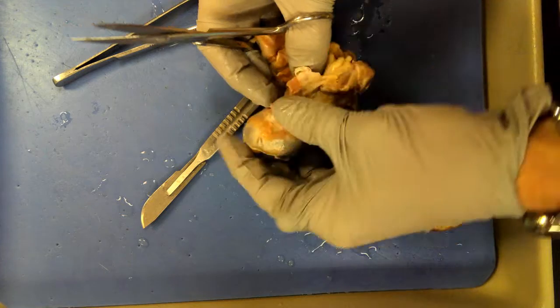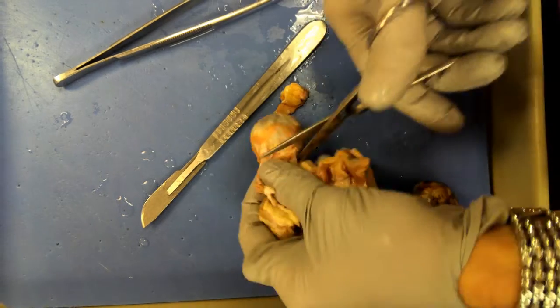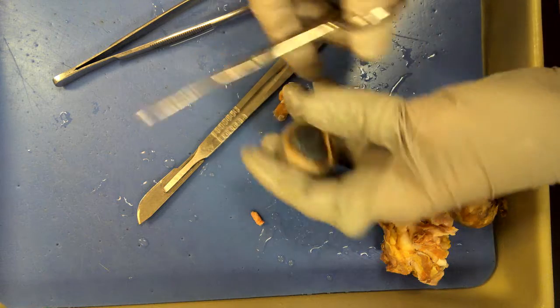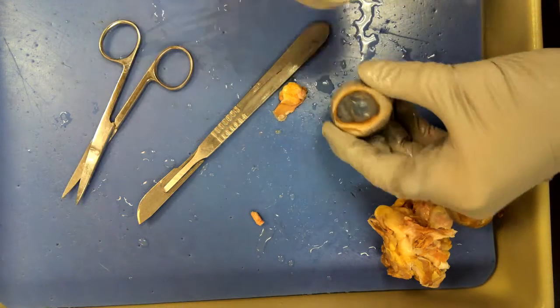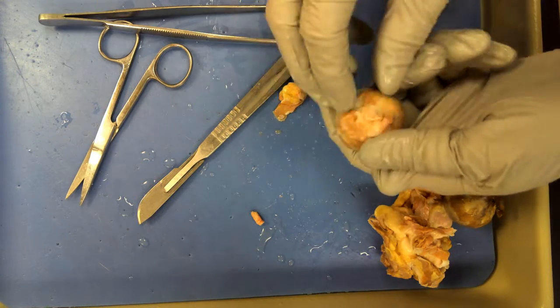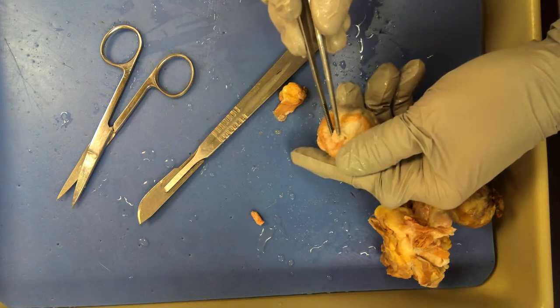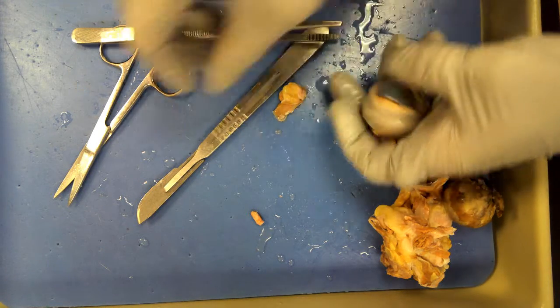Hopefully it hasn't been blurry the whole time. So now I'm going to clip off all this junk because I don't have to worry about the optic nerve anymore. At this point what you can see is the cornea, the sclera, and that white nubby thing right there — this thing right here — which is the optic nerve.